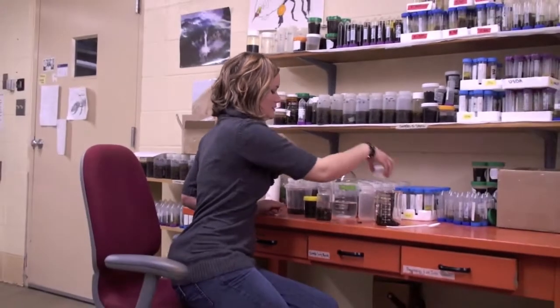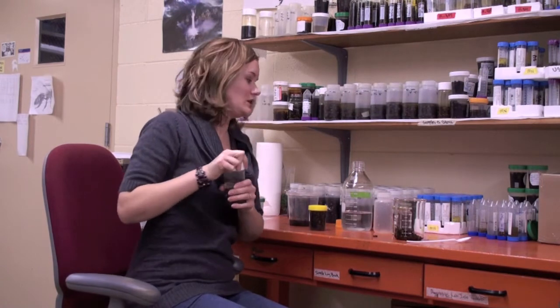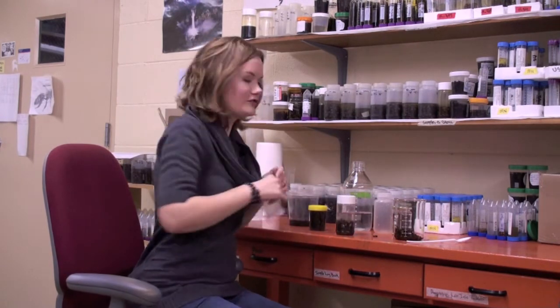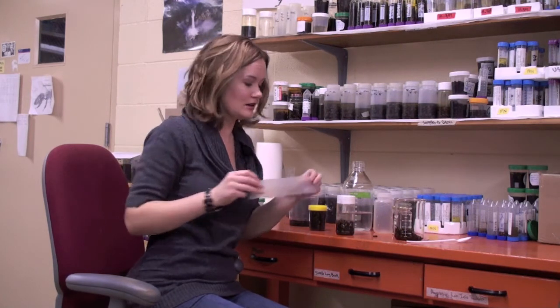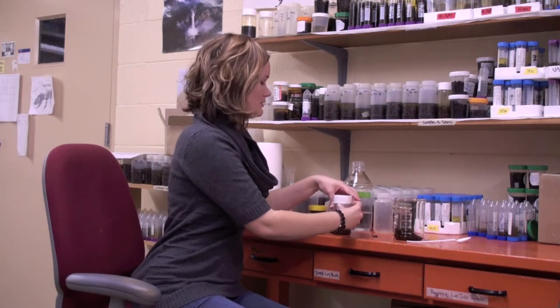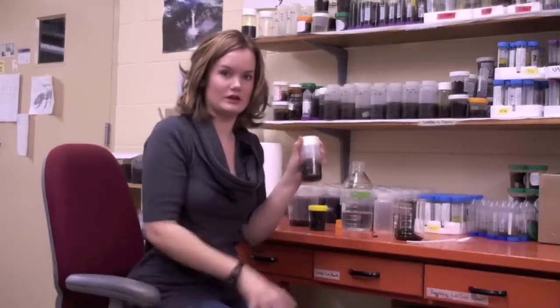The next step is to put the lid on really tight, so none of the alcohol comes out when it's shipped to me. And what I prefer, if you have it available, is to wrap wax paper around the lid. That's just to reinforce it. So that's about perfect.